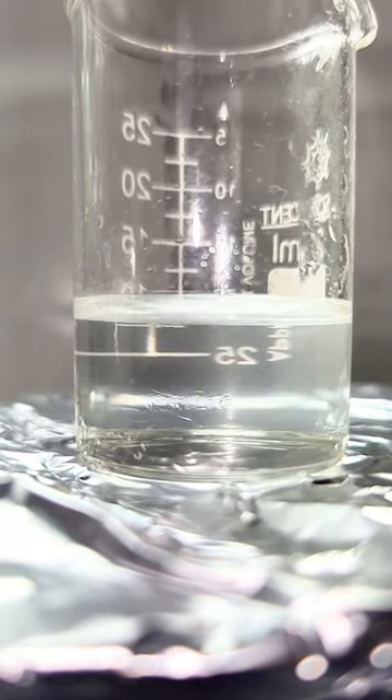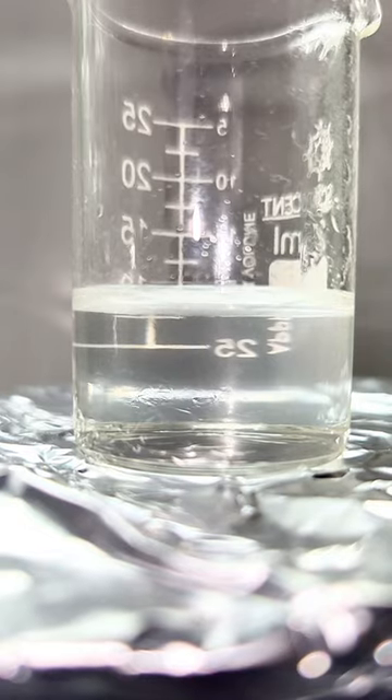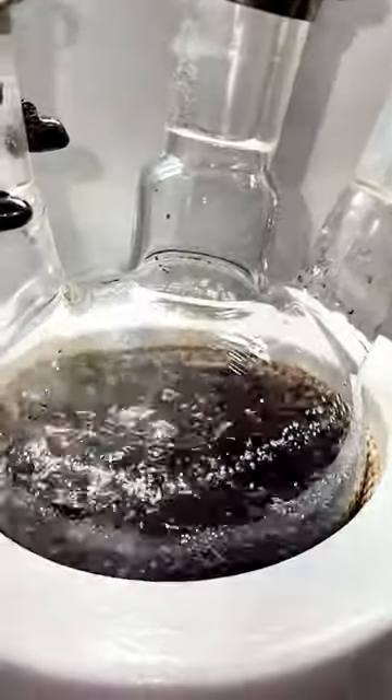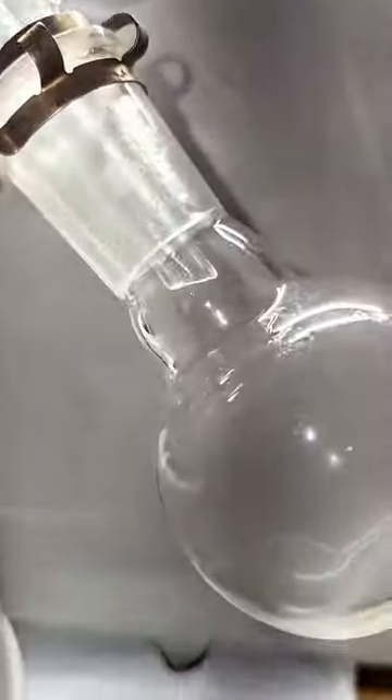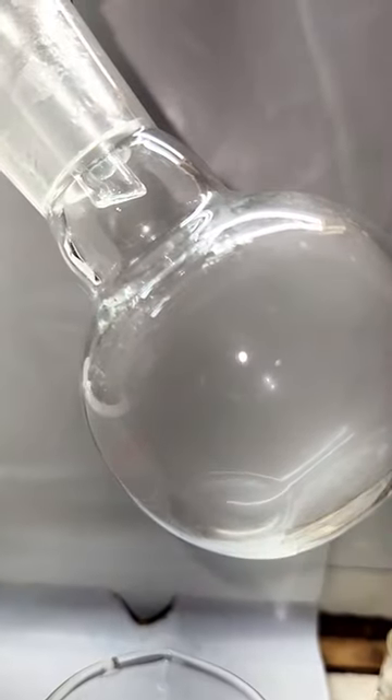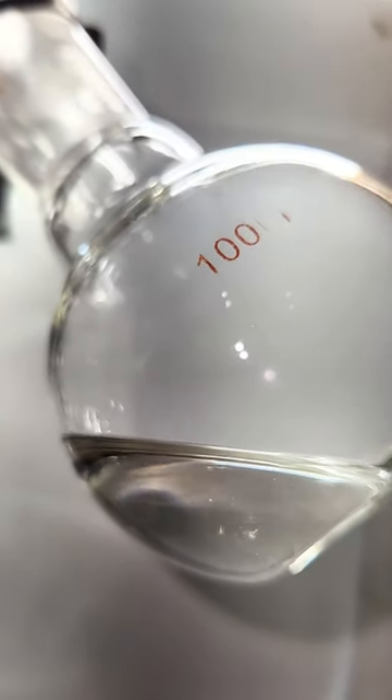Sulfuric acid is also nearly twice as dense as water, and because of this, it refracts light differently. As a result, you get this interesting ripple effect as the stronger sulfuric acid is distilled on top of the weaker sulfuric acid. This beaker is switched out every 15 minutes until the rippling effect no longer occurs, which indicates that I'm now distilling over 98% pure azeotropic sulfuric acid.